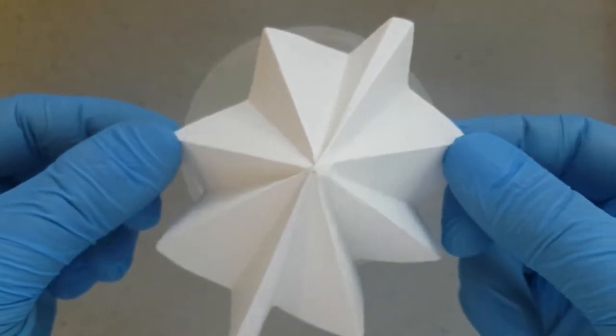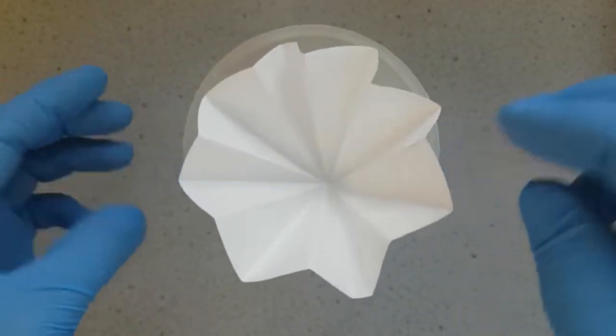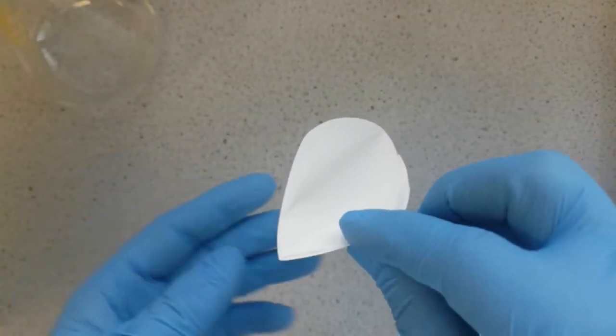This is because we've increased the surface area of our filter paper compared to, say, if we did a cone-shaped fold.